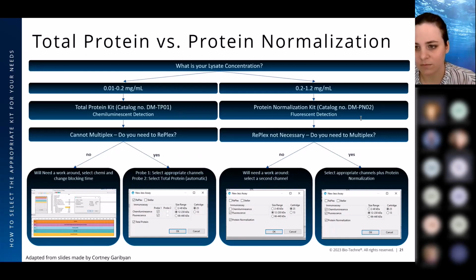Yes, okay. And in other targets, we have our target peak and the protein normalization graph doesn't have any of those similar peaks to our target protein. And the problem is, why does it differ on the same samples and the same lysis to begin with? And second, if there is that peak that repeats our target protein, it technically increases the whole area of protein normalization. So it makes that normalization biased, right?